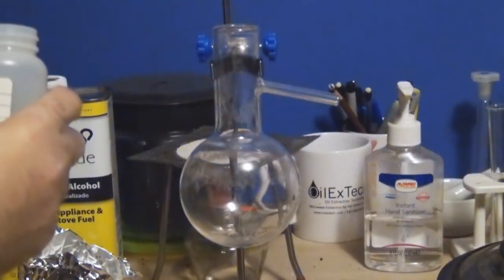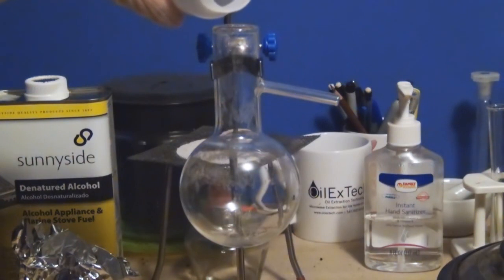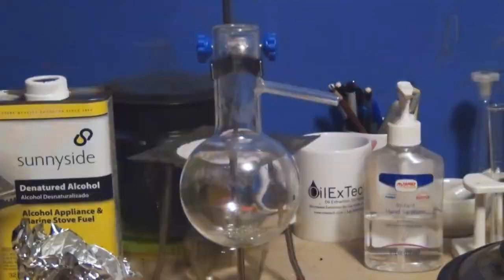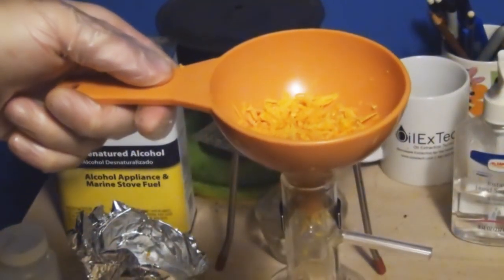What I have is a 150ml round bottom flask. We're first going to add boiling beads. These will keep everything from bumping and hopefully keep everything at a nice even boil. We're going to place a few of these in the round bottom flask and then move on to adding our orange zest.